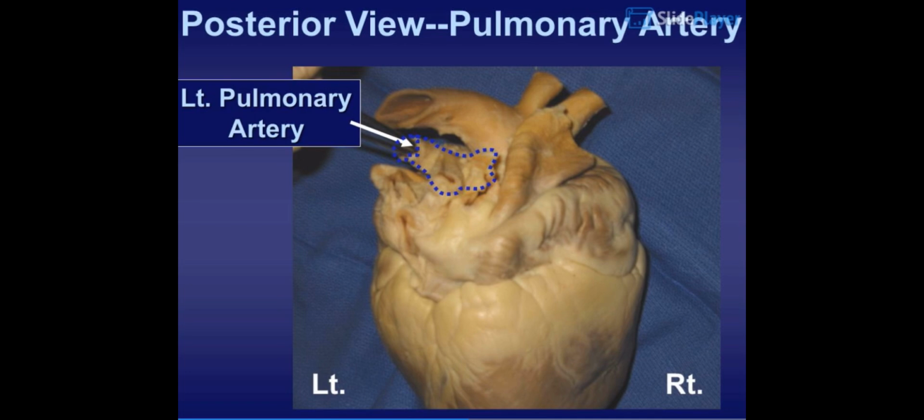Left pulmonary artery. Explanation. After the blood leaves the right atrium, it flows to the right ventricle which, upon contraction, transports the blood through the pulmonary arteries to the lungs. The pulmonary artery comes off the right ventricle as the pulmonary trunk. The trunk then divides to form the right and left pulmonary arteries. The pulmonary arteries lead to the left and right lungs.